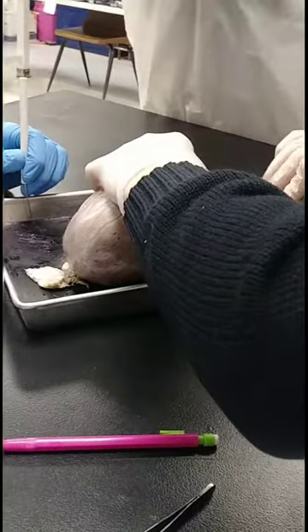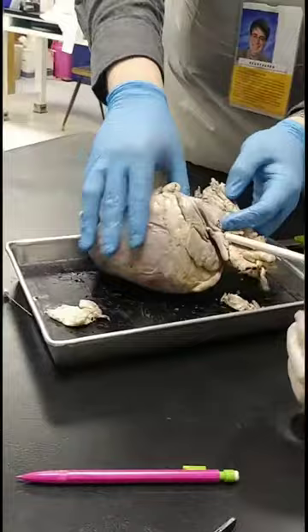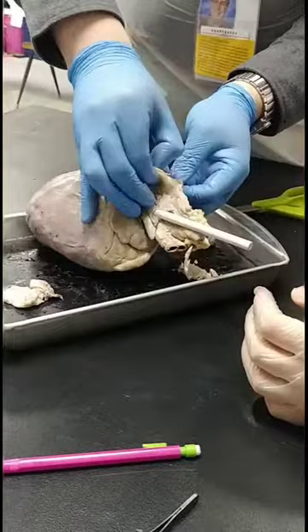Let's see what you've uncovered. Put the scalpel down. He's trying to cut off some fat. Yep, there's a little fat on top of it. So this pig had a happy life. And now we can look at his heart.